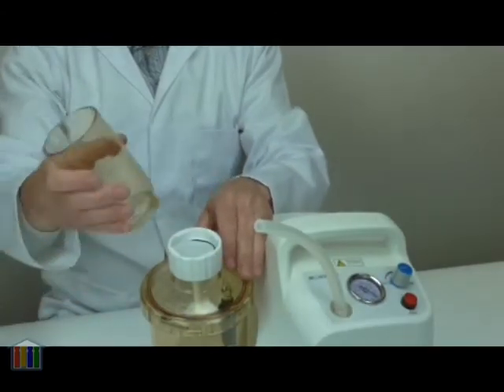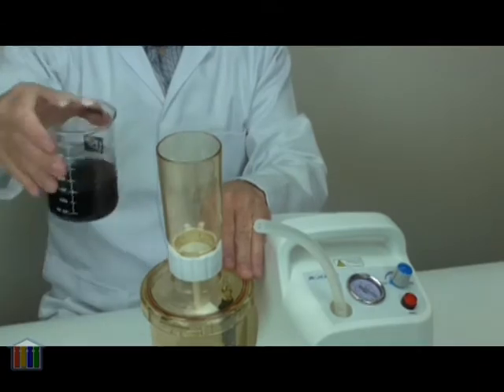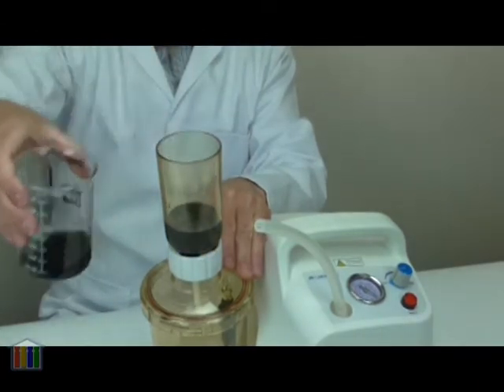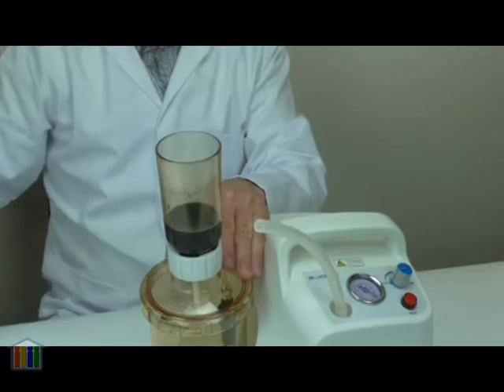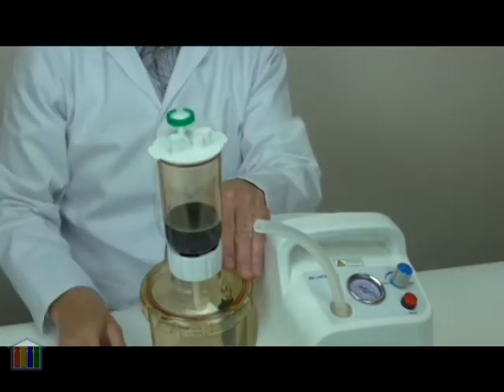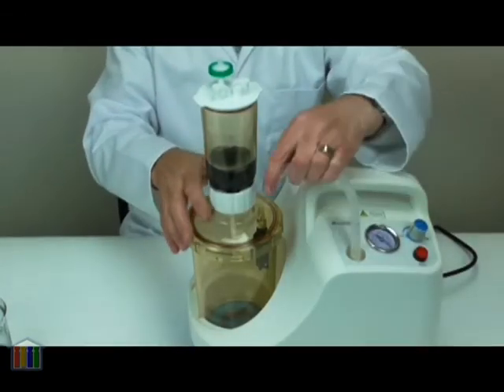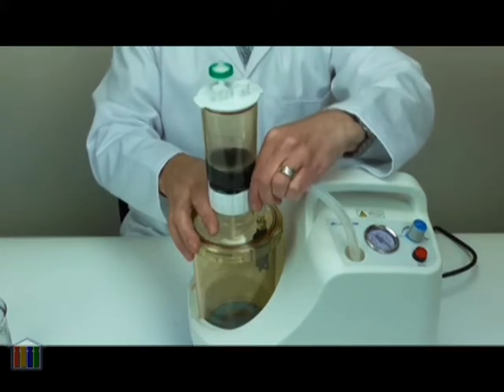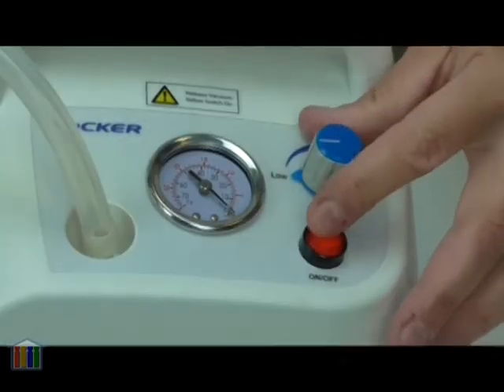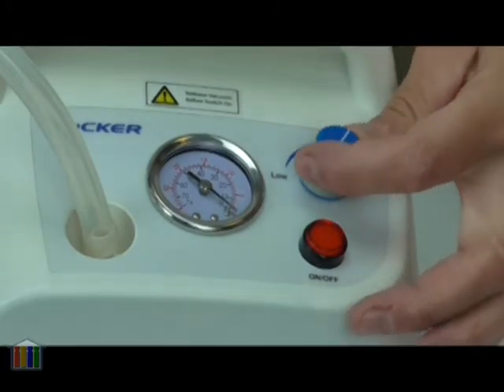The filter is held in place by the sample chamber which fits on top. Place your sample into the chamber. Optionally you can place a lid on the top which can prevent dust getting into the system. The vacuum pump is connected by pushing on the flexible tube and the pump started by pressing the start button. The amount of vacuum is then controlled by the position of the knob.